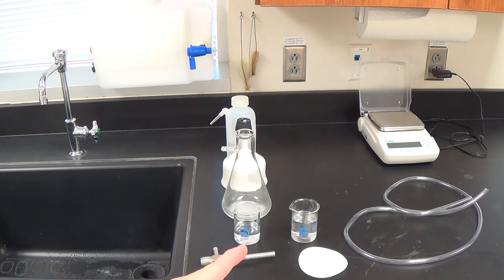When we mix the two, we're going to get a precipitate forming that is going to be calcium carbonate. The sodium will stay soluble. The chlorine that the calcium chloride probably started as is going to stay soluble. It is the calcium carbonate that's going to precipitate out.